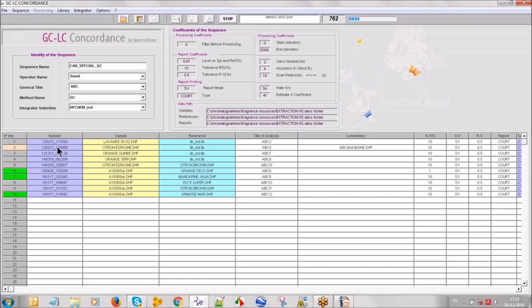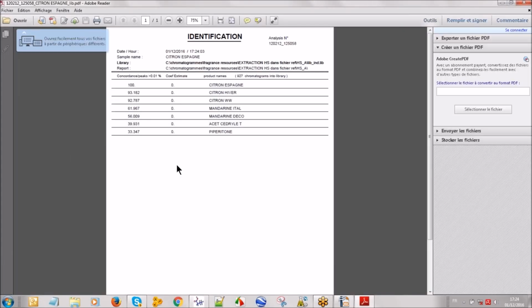You've probably seen that in the first webinar when we were comparing some wine, I think. It's quite impressive, it goes fast. Look at all the raw materials, and almost instantaneously it gives you a score of comparison with all the other raw materials present in the directory.